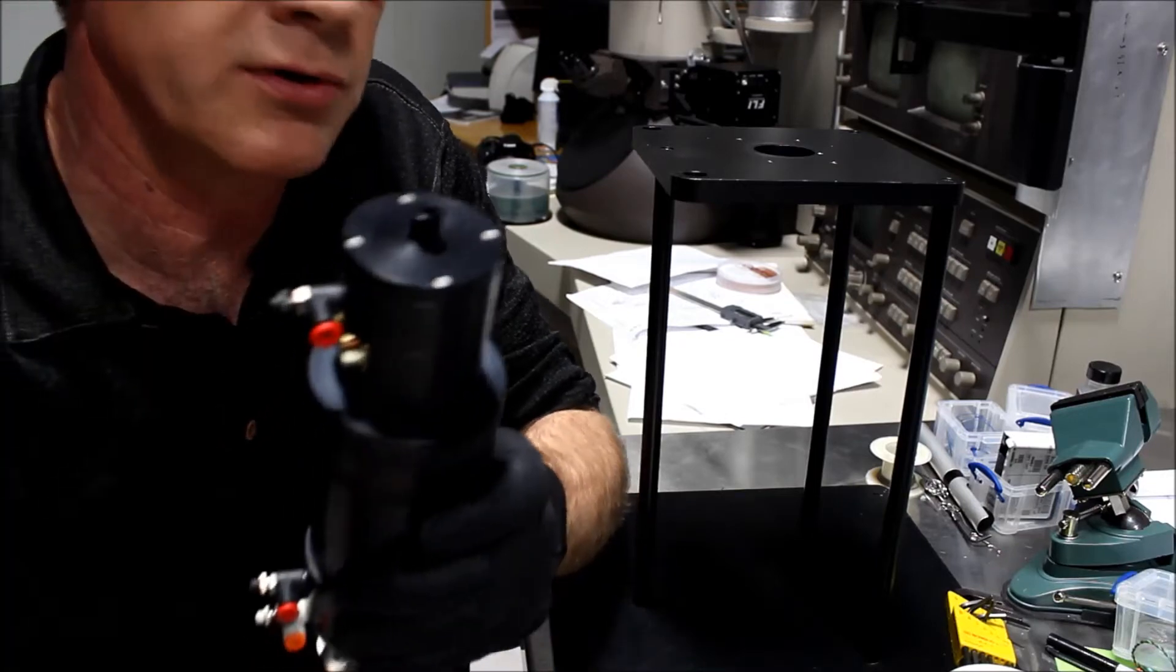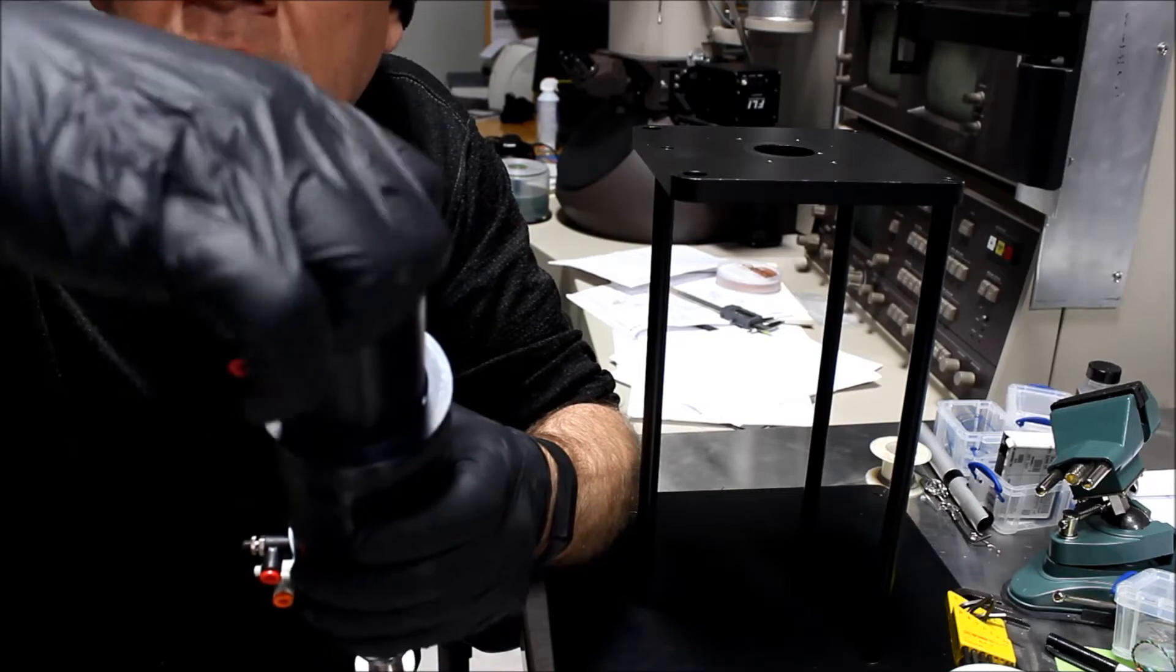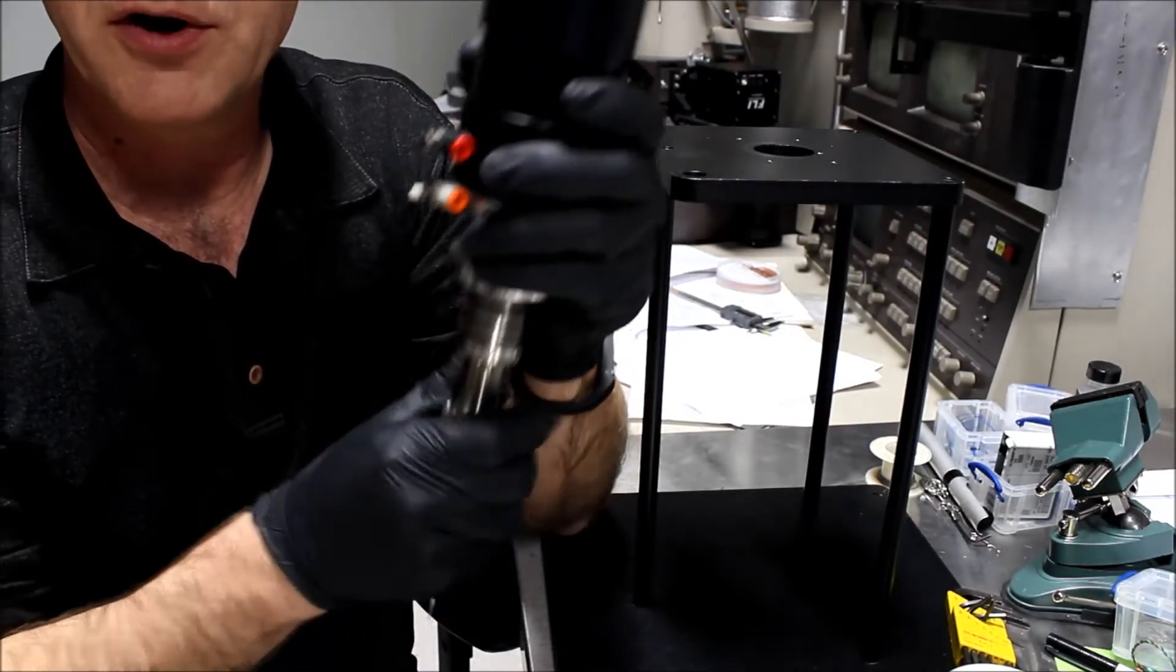Once the set screw is loose, we can tighten the little thumb screw, turn it clockwise, and we can turn that until we feel the force increase, and then we know I've turned it far enough.